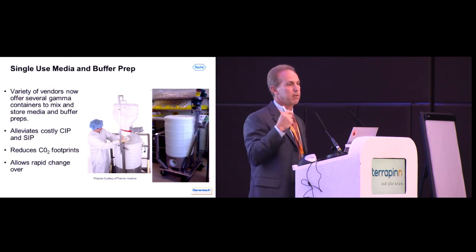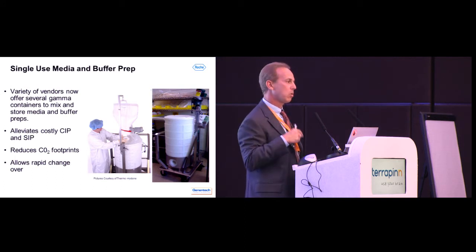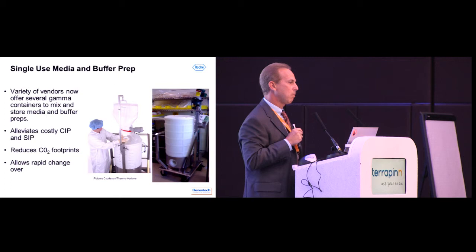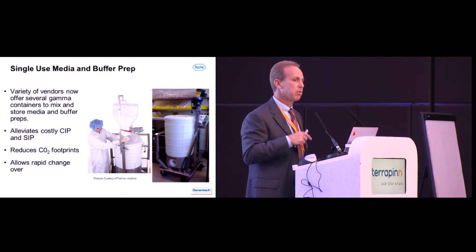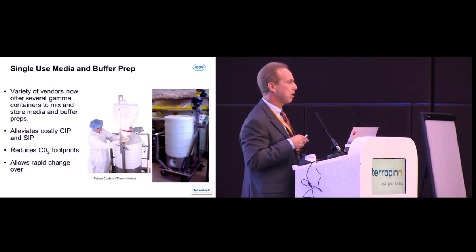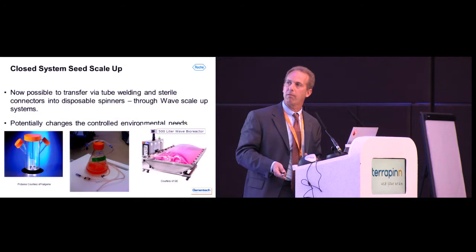So if you move back for a minute and you think about the raw material, the plastic bead comes from Dow Corning, or Mobil, or Exxon. These are very large corporations. The plastic that they make for biotech and pharma is an extremely, extremely small slice of the pie of their plastics. And so their change control process may not be what you think it is, going to the Thermos and SSBs and Millipores, et cetera. So understanding and coordinating your raw materials and changes matters. I don't know if people have heard some of the studies and stories about films having an effect on cell growth. It's been well characterized and published now. So there are some films that can affect cell growth deleteriously, not to mention extractable, leachable profiles.